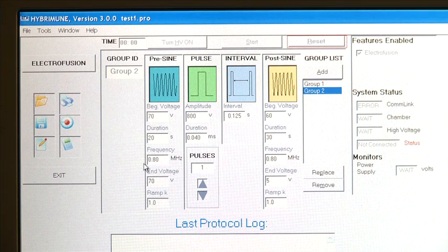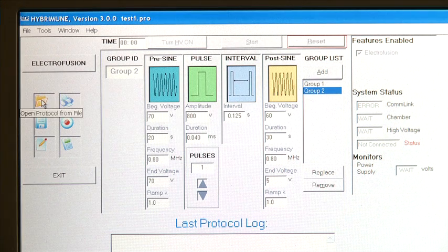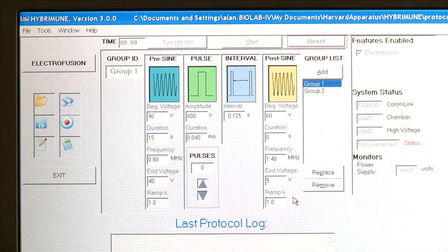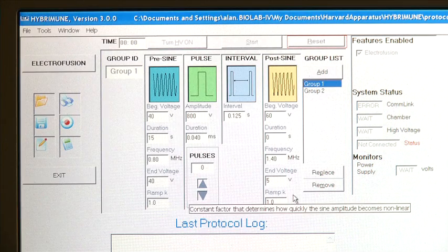To retrieve that protocol in the future, click on the folder icon, select the protocol, then click Open and the protocol will open in the HYBRAMUN screen.